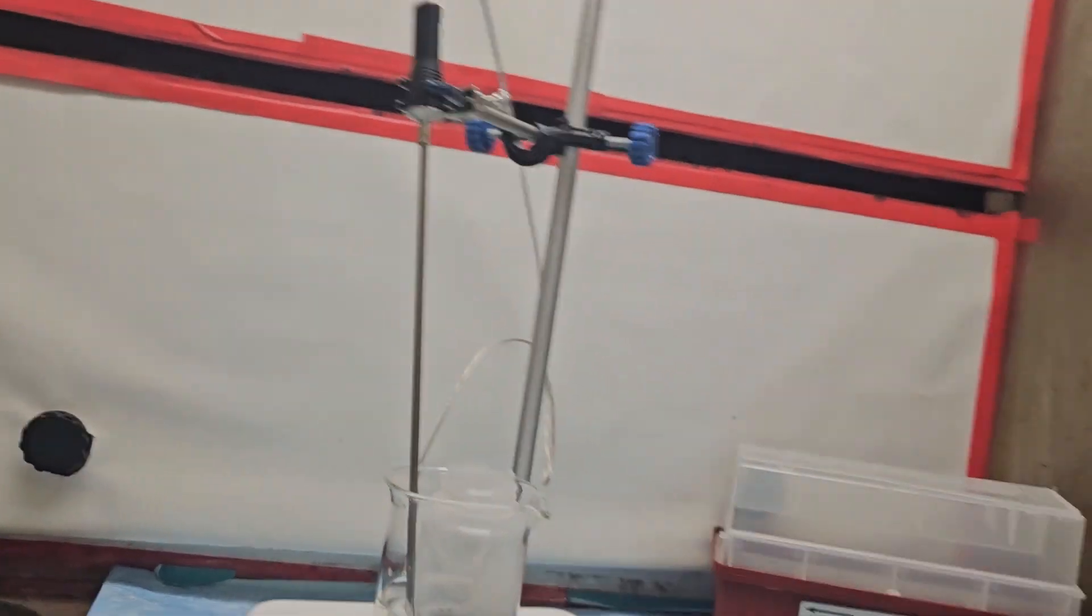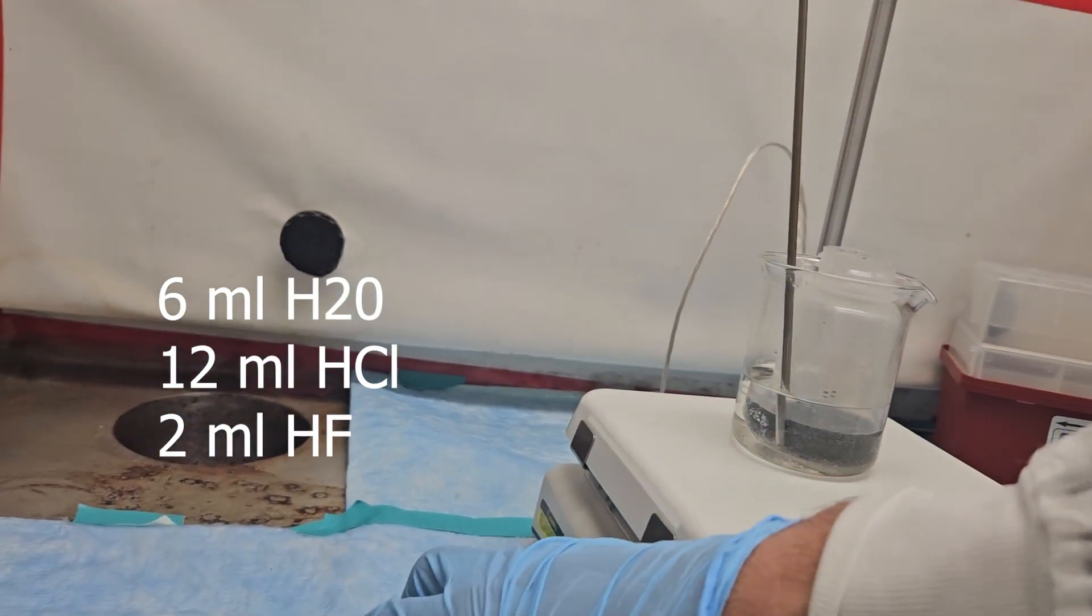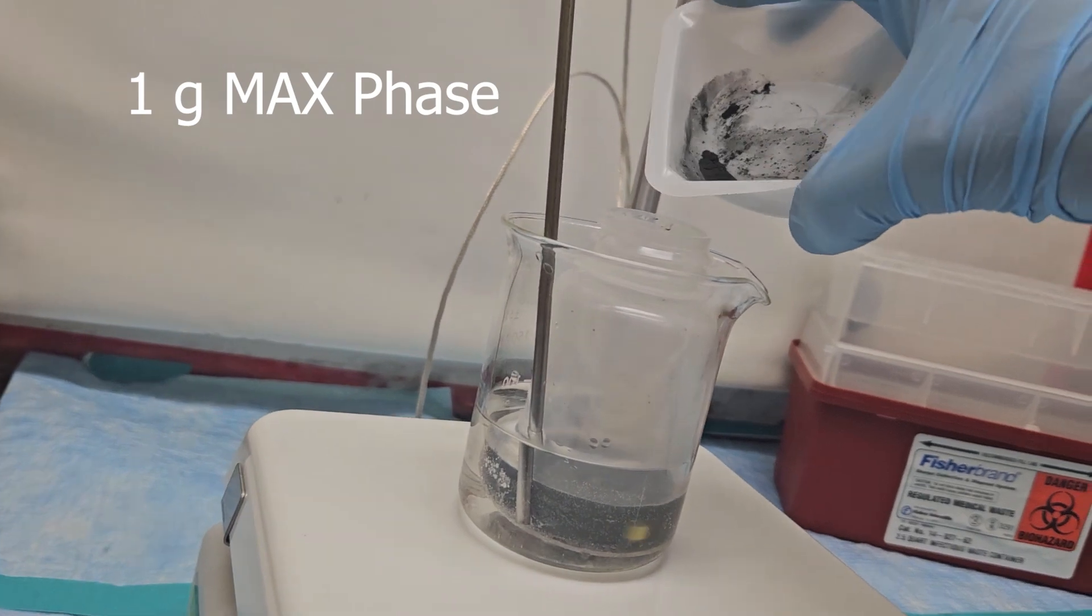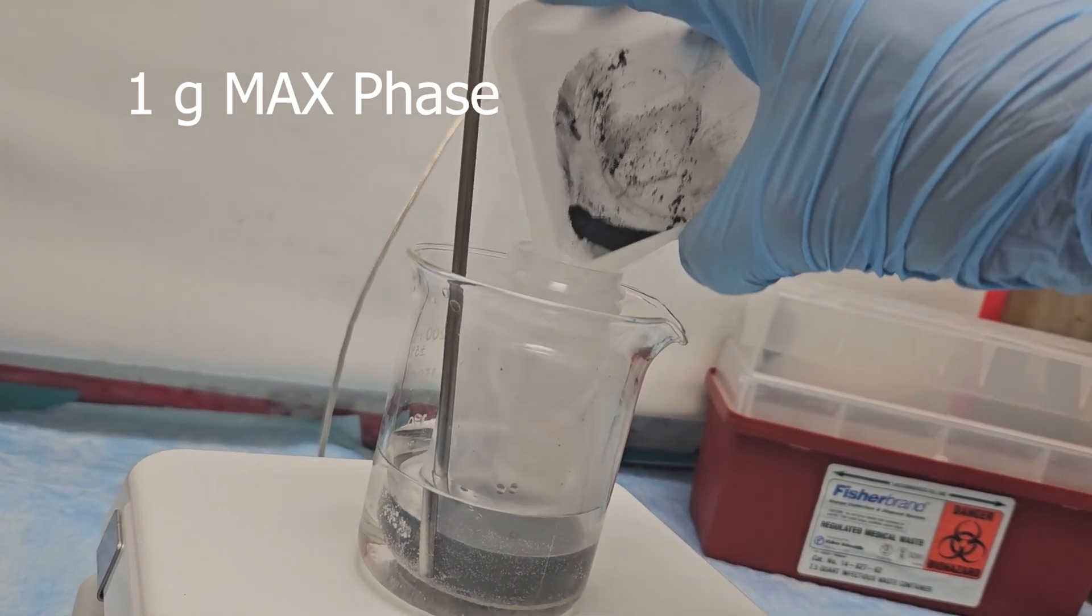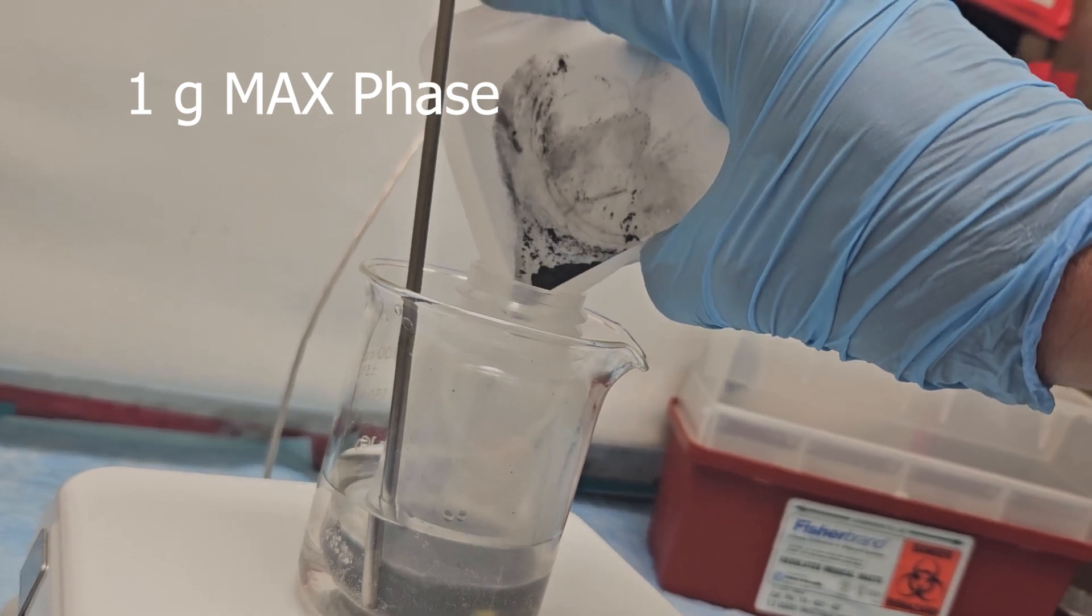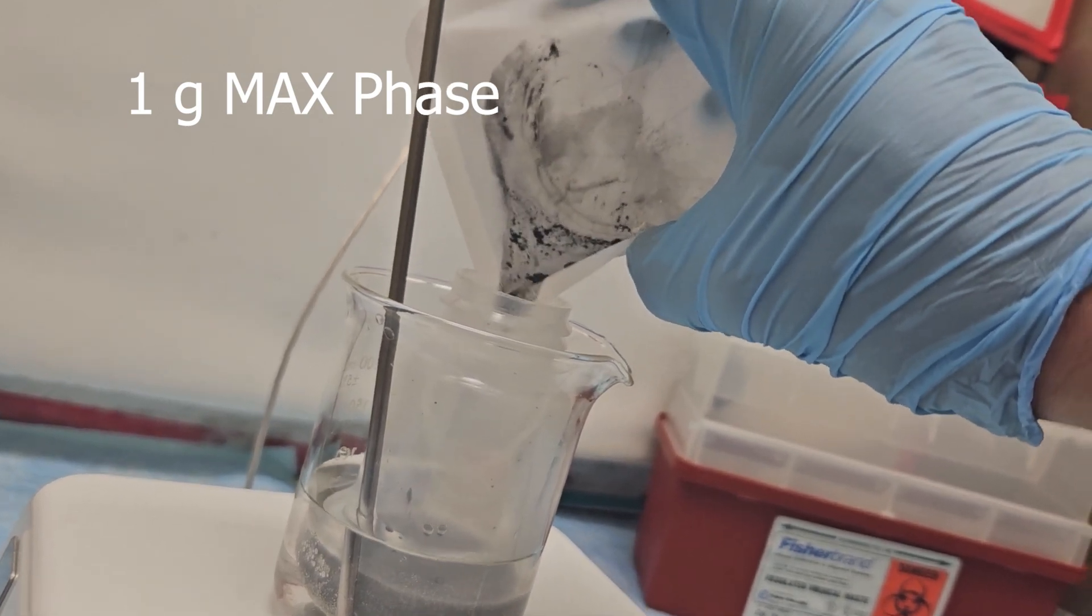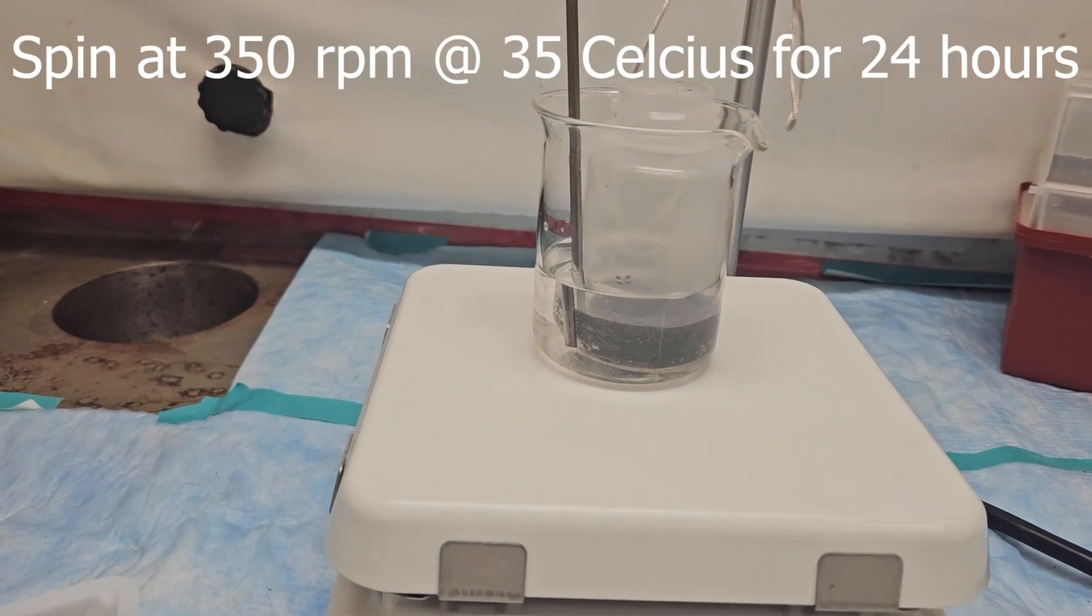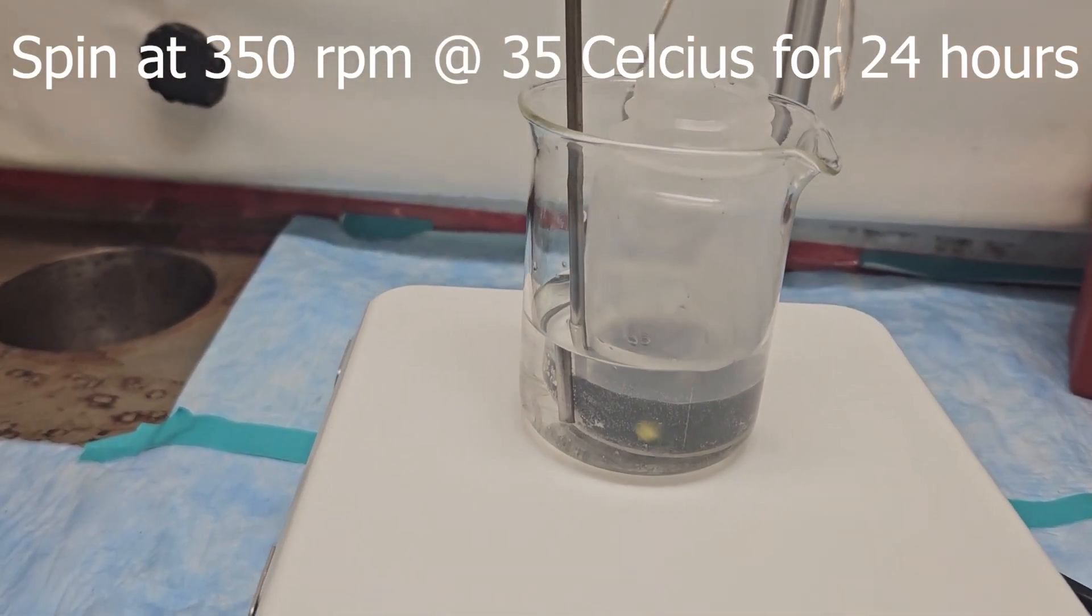Next, on a temperature-controlled mixing plate, combine 6 milliliters of water with 12 milliliters of hydrochloric acid and 2 milliliters of hydrofluoric acid, as well as our 1 gram of MAX phase powder. This is to be spun at 350 rpm for 24 hours in a water temperature-controlled bath at approximately 35 degrees Celsius.